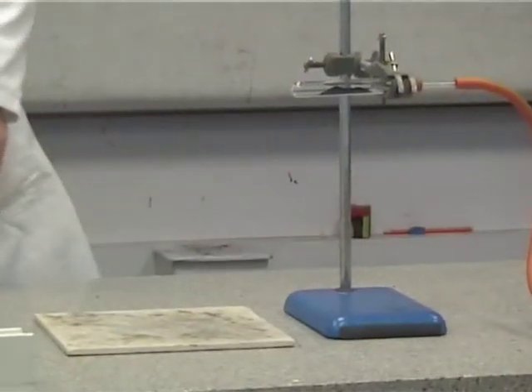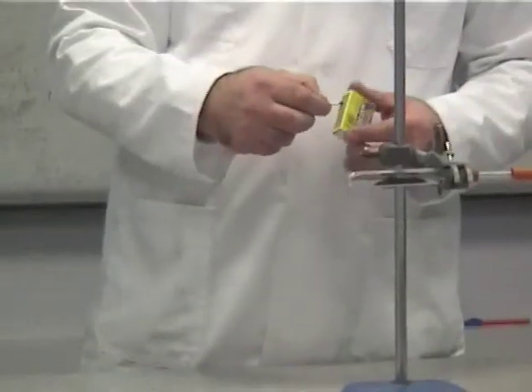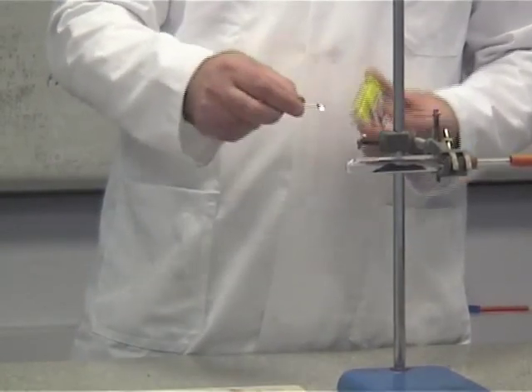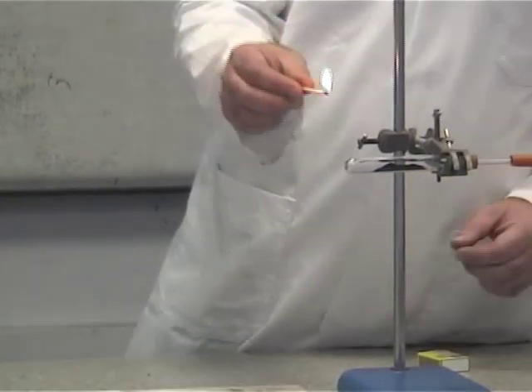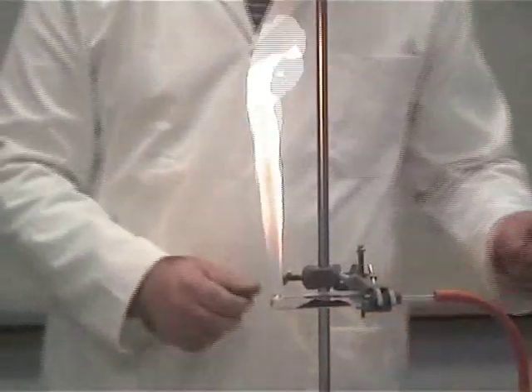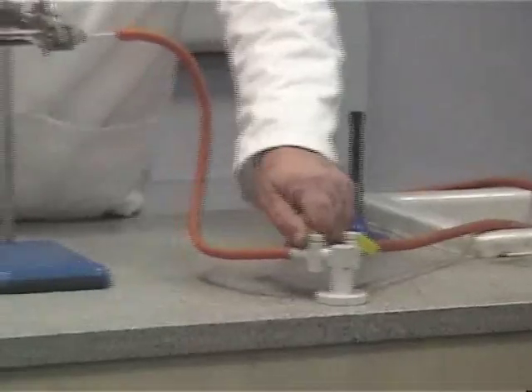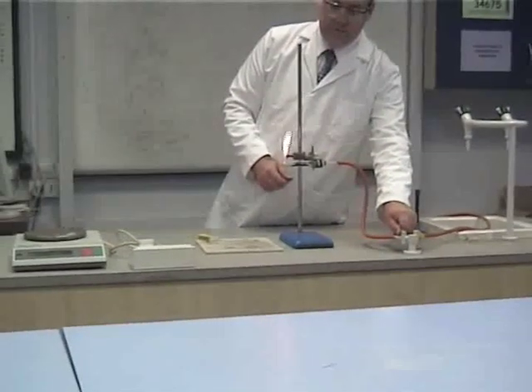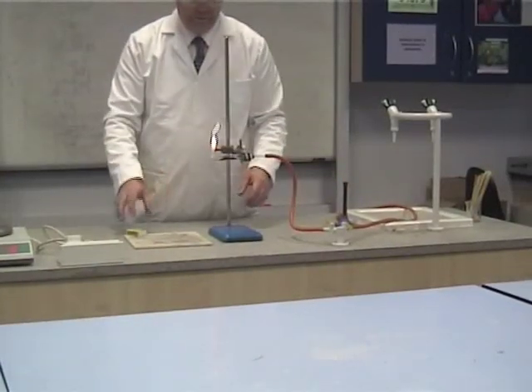and then we carefully set light, make sure the hole is pointed upwards. And if you're obviously letting the students do this, you need to make sure, or just keep an eye on the size of flame that appears and the direction in which it goes. Oops, there we go. Once you've got that aligned, you can then use the gas tap to control the height of the flame. And generally, about that sort of height will work fine.